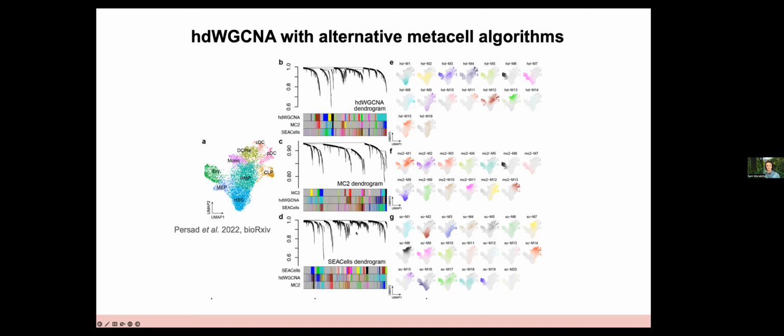They are all slightly different. And one thing that I found interesting is that I don't think either of these actually account for the biological sample or the cell type or cell state. So if you're interested in Alzheimer's disease, you probably have case and control. This would mean cells from case and control could actually mix together by following their default tutorial. So you'd have to write your own custom script to get it to work in the way that you wanted if you didn't want to mix those things up.